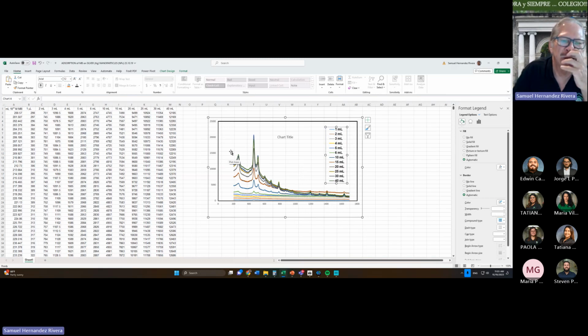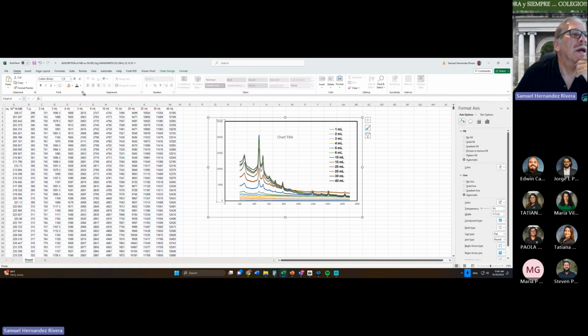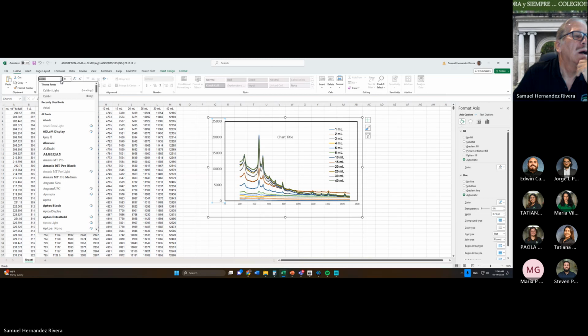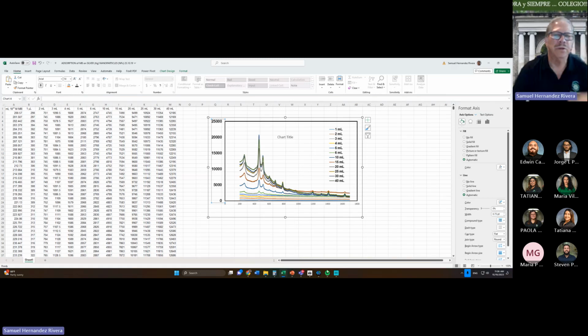Okay, then the next thing is move this a little bit and change this to Arial 14. Very good. Okay.